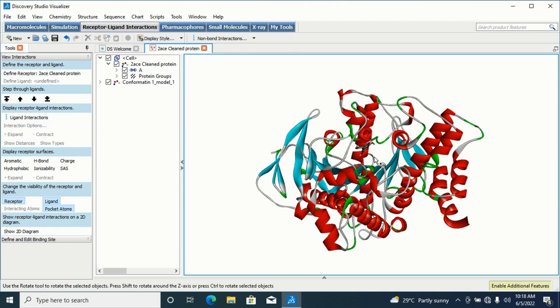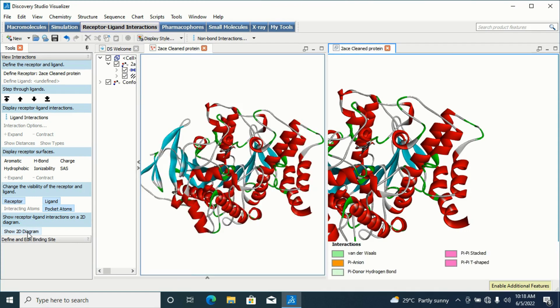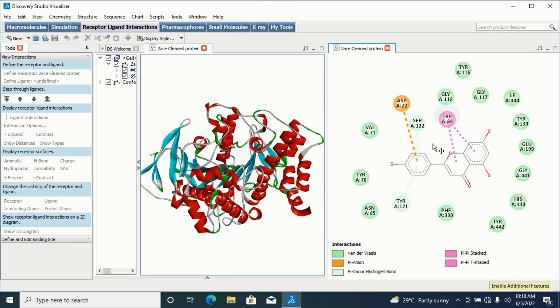To see the 2D diagram, come to the left side where you see different options. I'll generate the 2D diagram by clicking 'Show 2D Diagram' — it's second to last in the options. If I click on it, it will generate my 2D diagram. Look — it has generated my 2D diagram showing the interaction at the active site for this particular conformation.